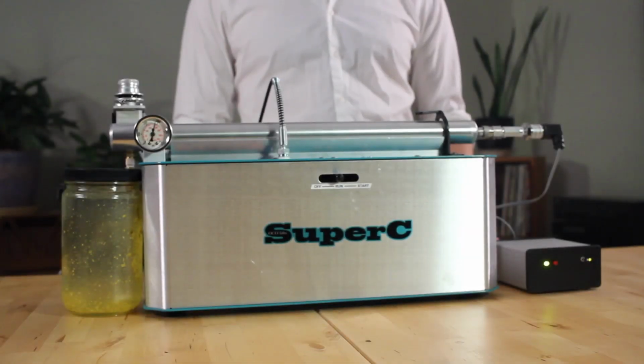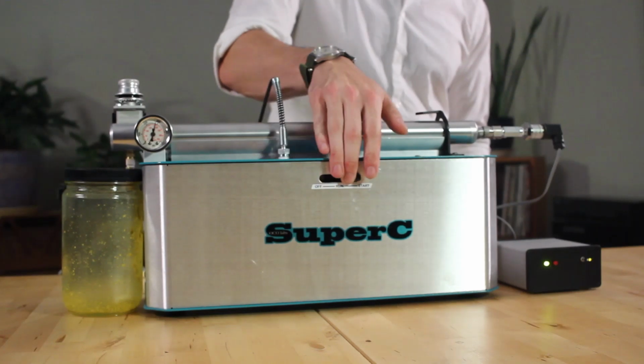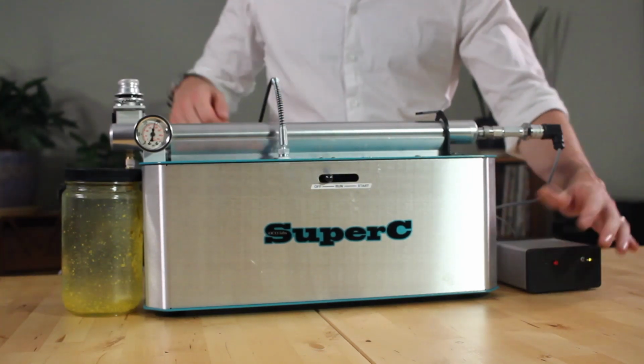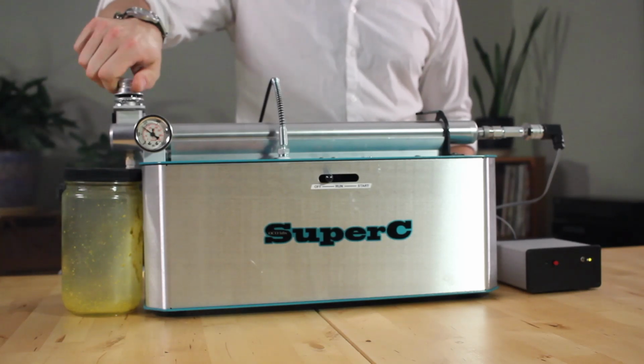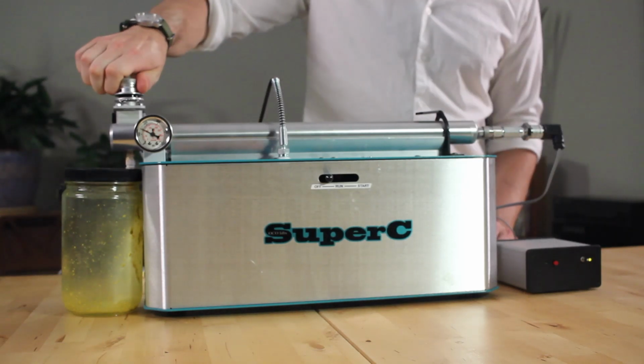Once you reach the end of your runtime, you can depressurize your system. This is done by turning off your CO2 tank, turning off the motor, and the autopilot. Finally, you can release the pressure at your valve until the gauge reads 0. At this point, you can collect your extract.